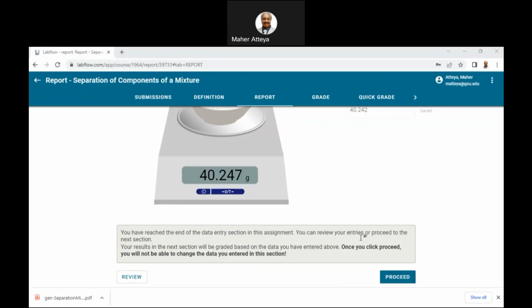So here it is. Click on proceed to enter.